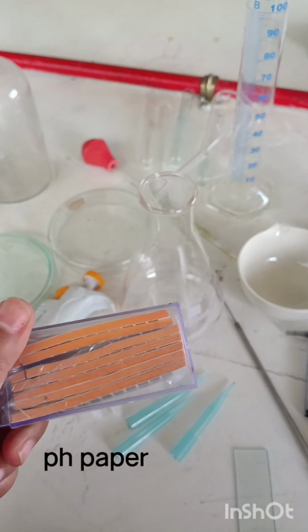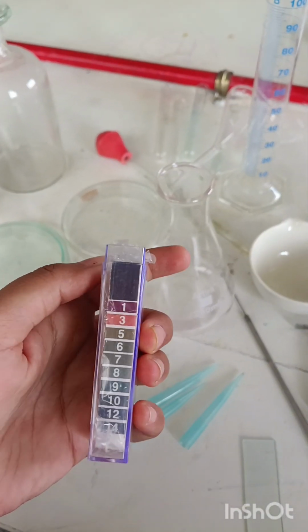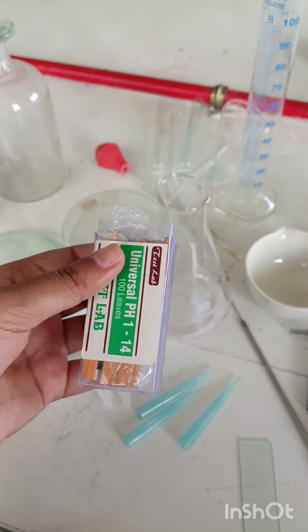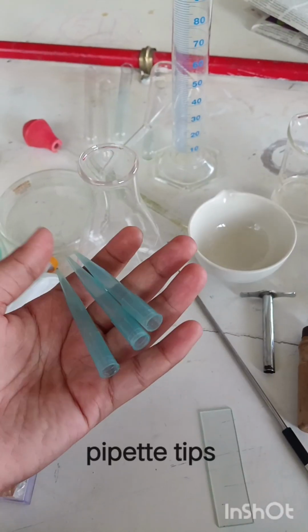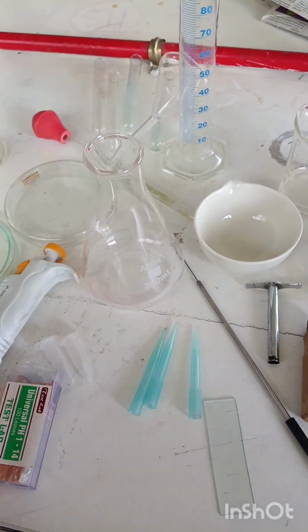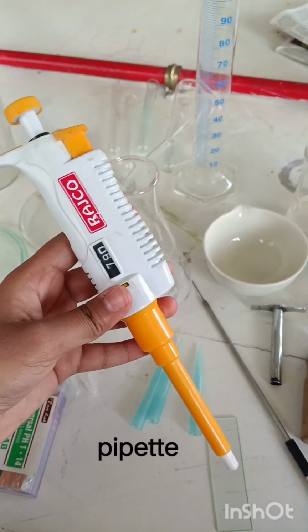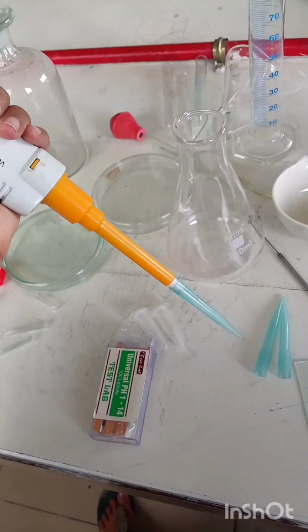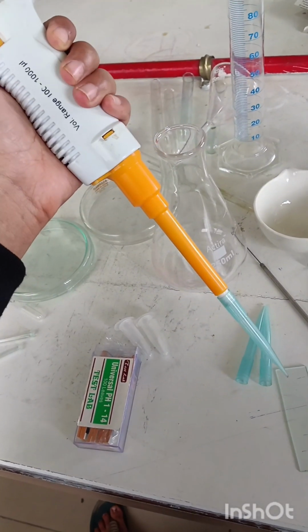This is pH paper, used to measure the acidity or alkalinity of a solution. These are pipette tips, disposable plastic tips attached to a pipette to prevent cross-contamination. This is a pipette, a laboratory tool used for measuring and transferring small volumes of liquid.